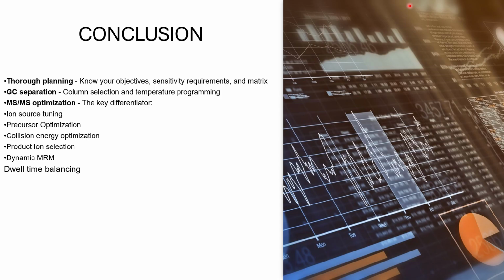The key to success is understanding the fundamental principles we have covered today, especially the MS optimization. Don't just use vendor defaults. Take time to truly optimize your collision energies and transitions for your specific application.